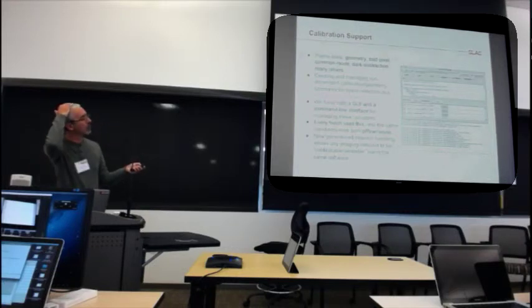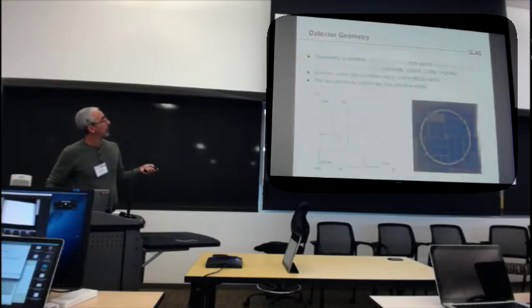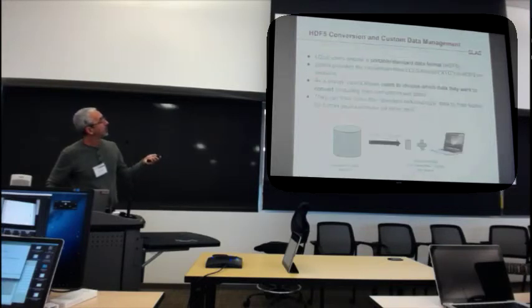You guys have done your own, which is fine because Psana was late to the game for reasons I don't completely understand. But it's kind of a shame we're doing the same thing. Especially for the geometry, since the geometry is a hard problem. That's all I'll say about that. Detector geometry, ideally we solve it once, not multiple times.